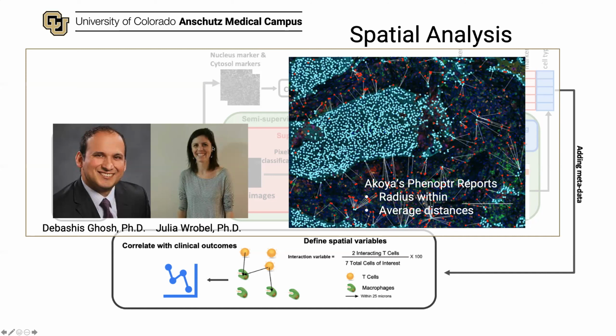So anyway, I highly encourage that if you're going to be thinking about these kind of experiments, to really think how you're going to take advantage of the amount of data that you're generating. What I've seen is that a lot of people are interested in the phenotypes that are there, and they're interested in some of the markers that are expressed by the cells, but it really sort of stops at that point. And there's so much more data embedded within these images that you could find relationships between, you know, how the cells interact with each other, or how they interact with tumor cells, and take advantage of data that you can't get from other non-spatial platforms.